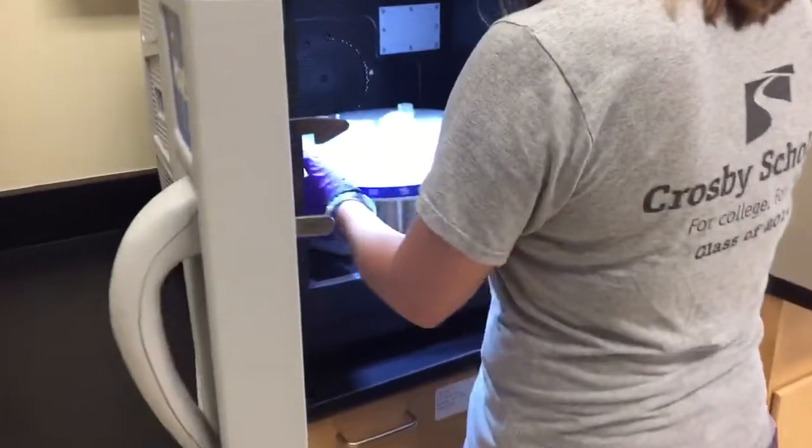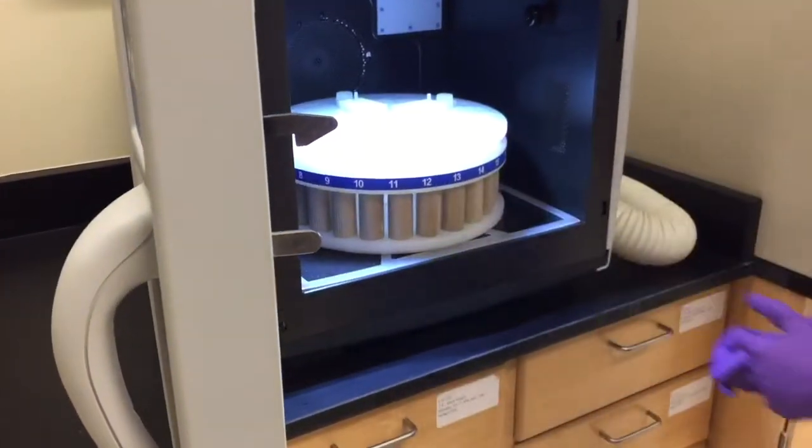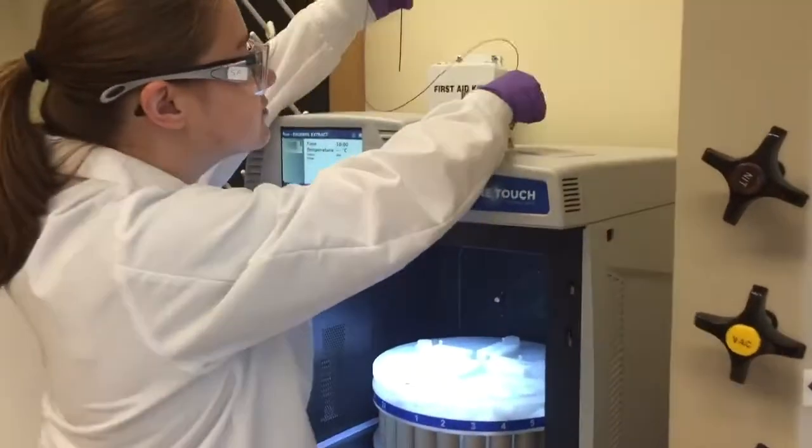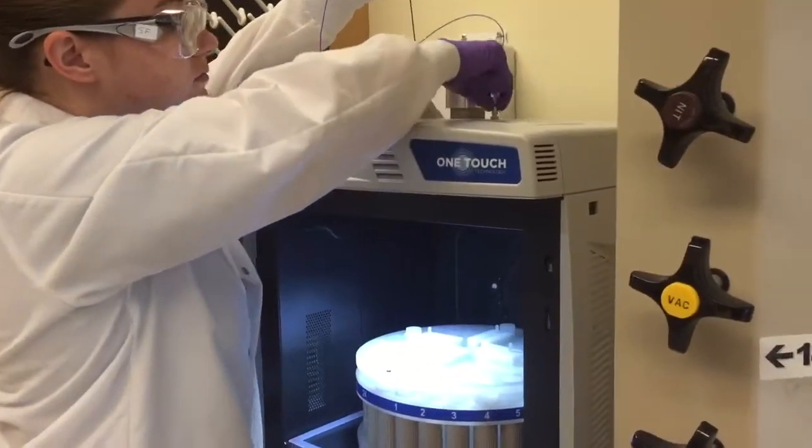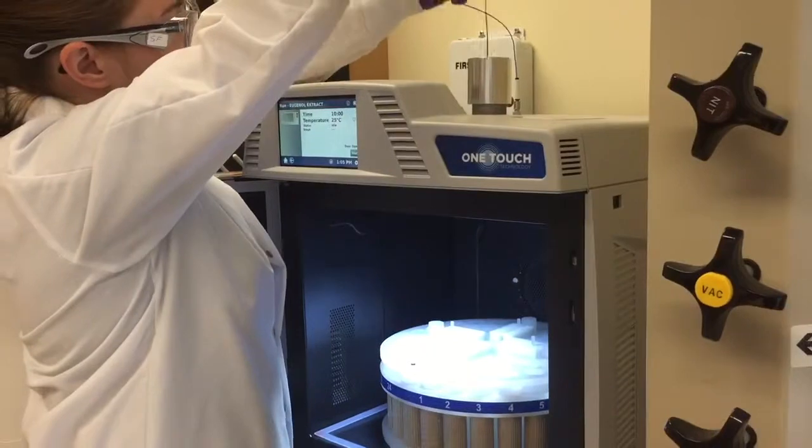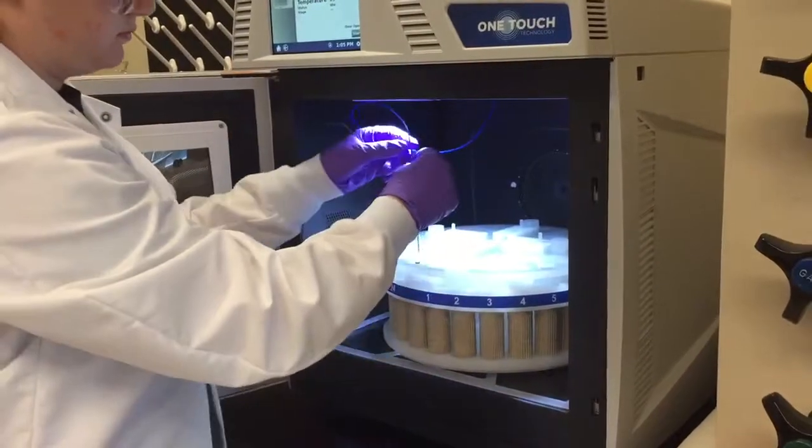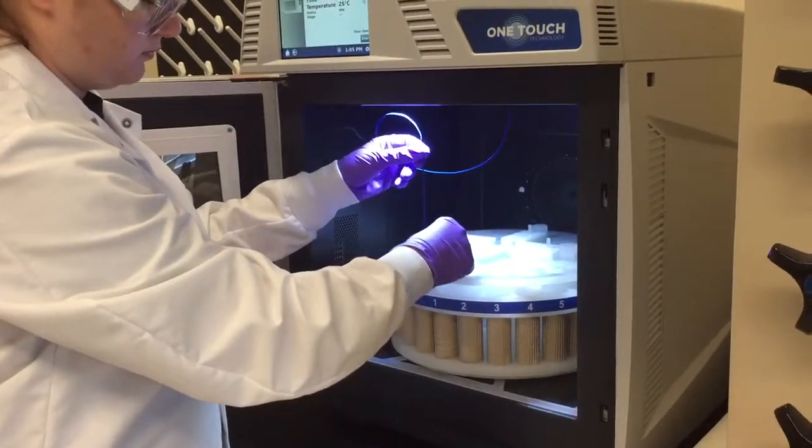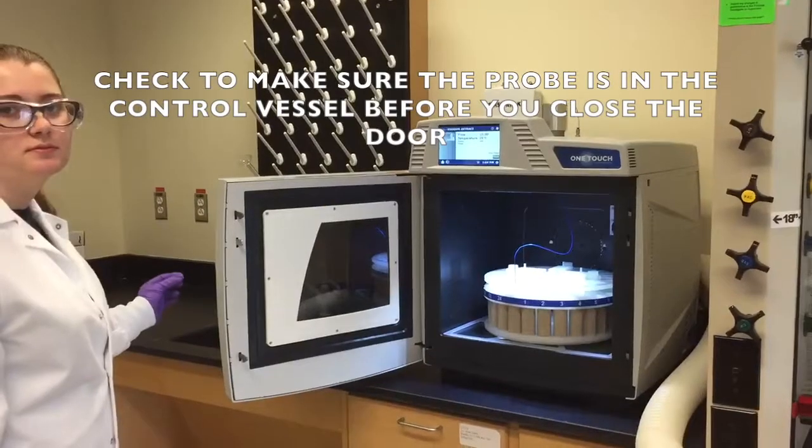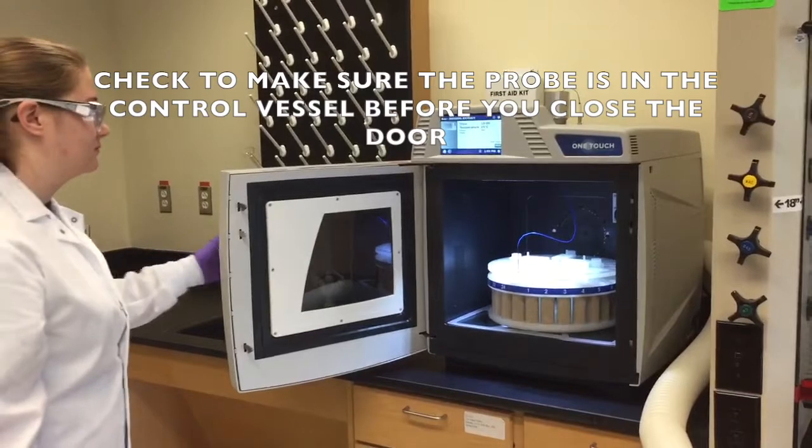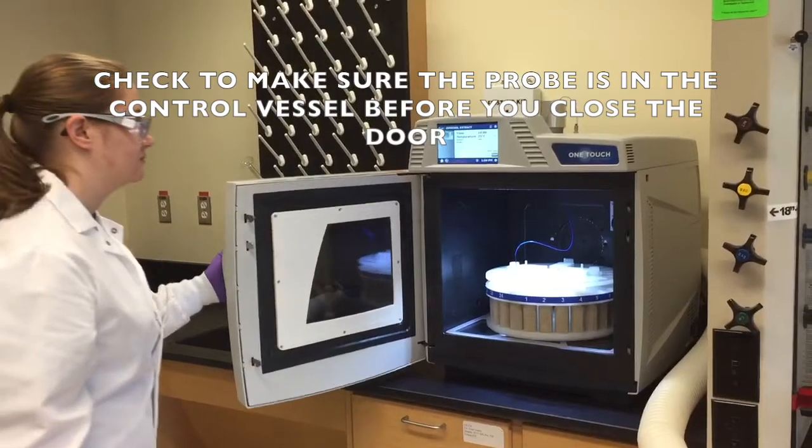Once it is properly seated, the turntable should not rotate. Slide the probe through the opening at the top of the microwave and insert the end into the thermal well nut on top of the control vessel. Check to make sure that the probe is not crimped, because the probe might break. Make sure that when you close the door of the microwave, the probe is inserted in the control vessel.